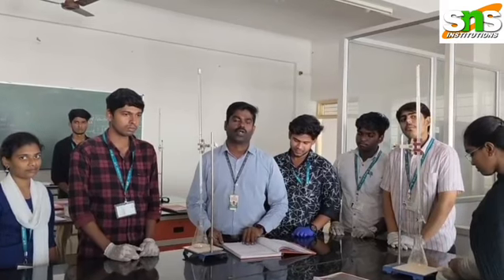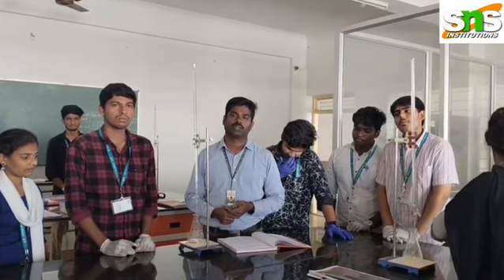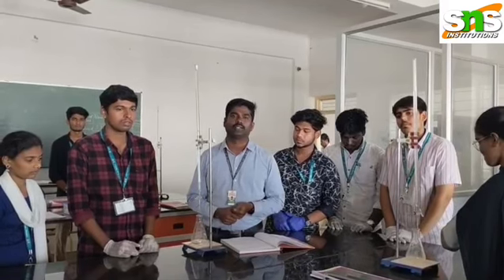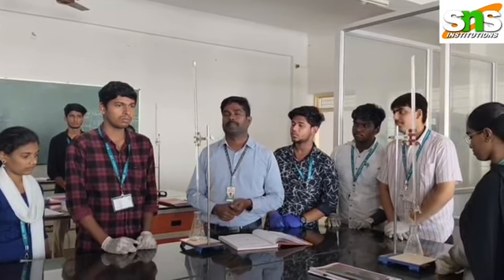Today we are going to learn a new concept related to volumetric analysis. In this volumetric analysis, we are going to learn the basic concepts of titrant, titrate, and indicator, and how to arrange the basic setup of these titrations. I am going to explain.